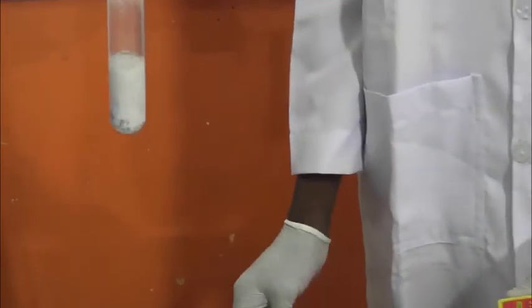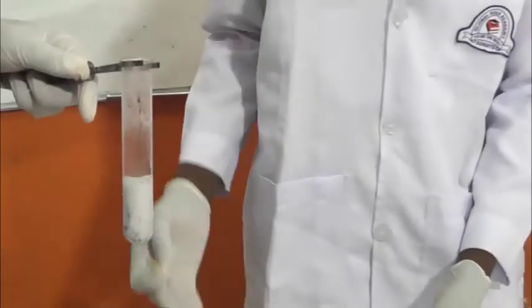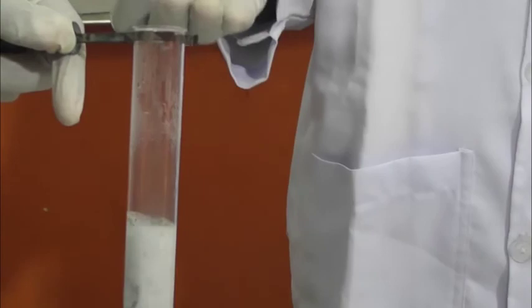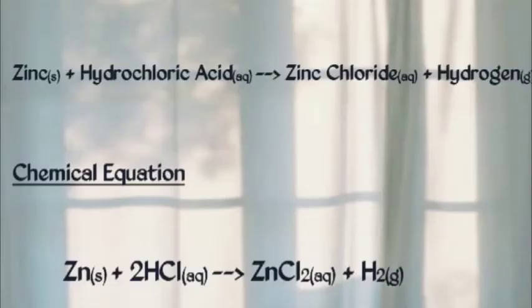Now listen. Wow, can you hear that sound? That's awesome. So this is zinc chloride. What was being liberated is hydrogen, which is flammable. Look at the balanced chemical equation demonstrating the displacement reaction.